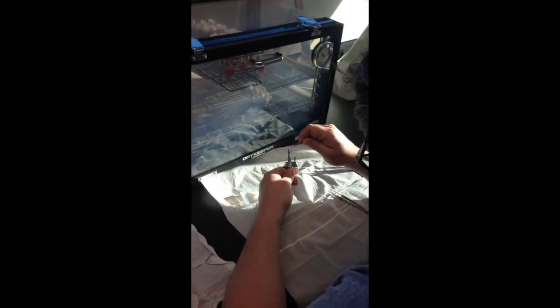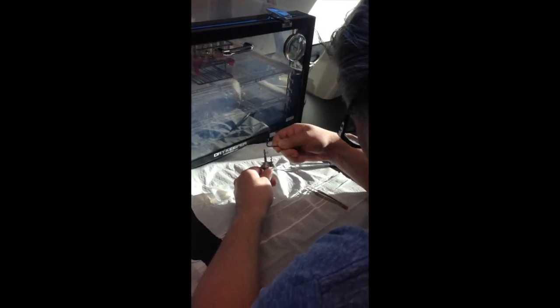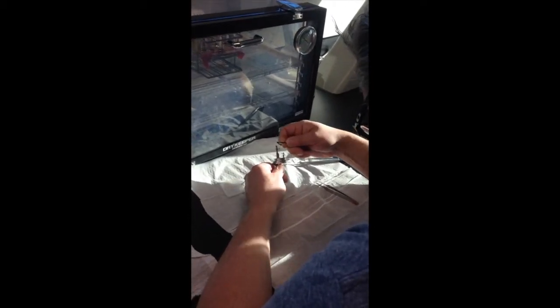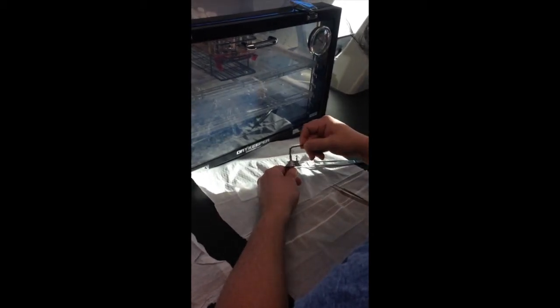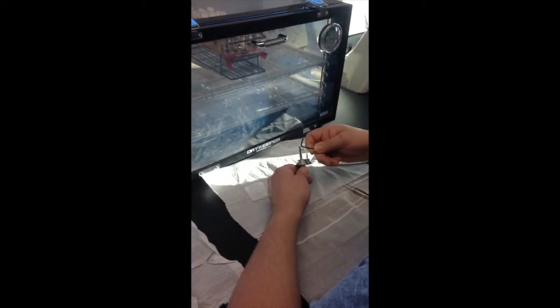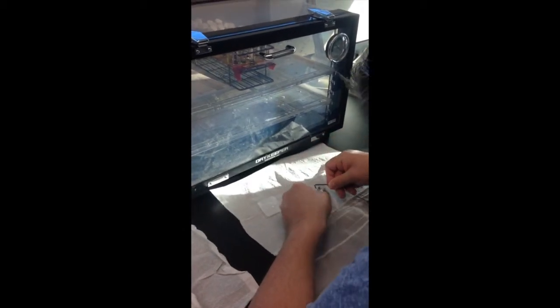Using the allen wrench, create four loops in the fuse. Be careful to not allow the wires to cross. If the wires do cross or touch, use tweezers to correct the issue.